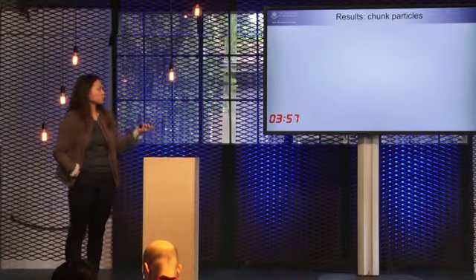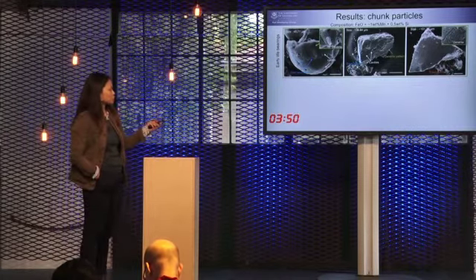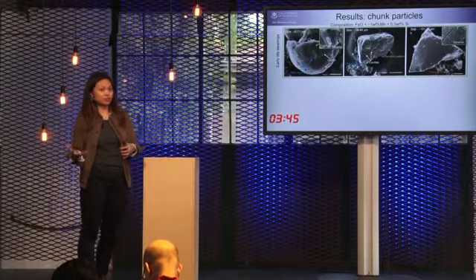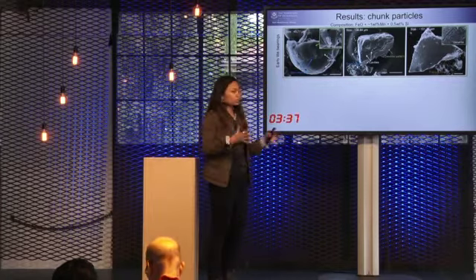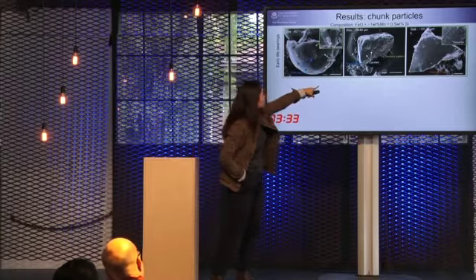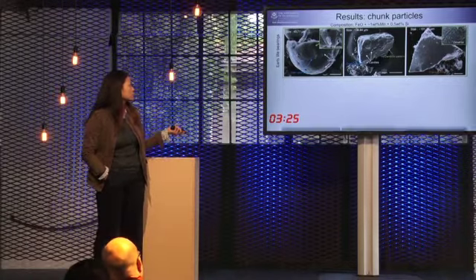The other thing I want to share with you is the formation of chunk debris. Interestingly, in the earlier life bearing, we think the formation of the chunk debris is from the breaking of the sphere particle, which has a dendritic pattern, as you can see here clearly. Here we roughly see the blue marked area as the original grain size, and in the fracture area we see the cavities and dendritic pattern. The one on the right-hand side shows you a very clear image.